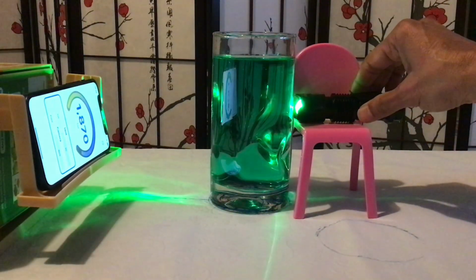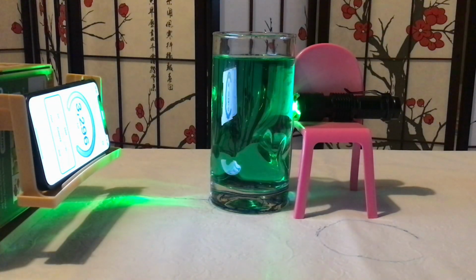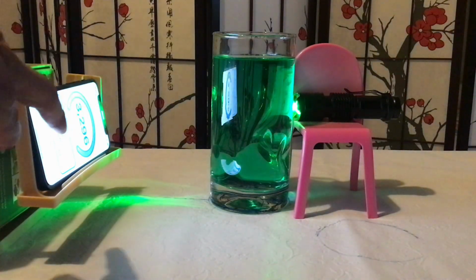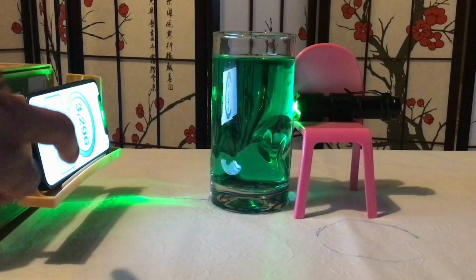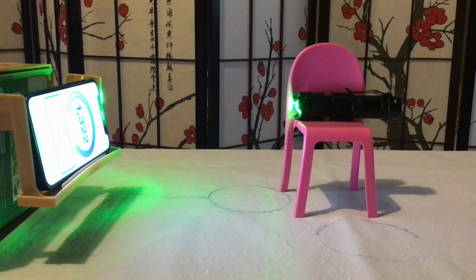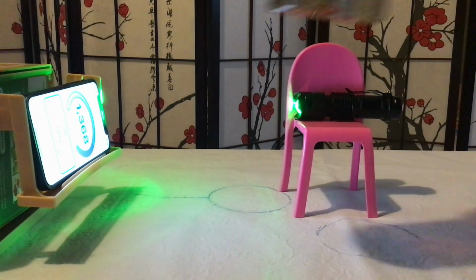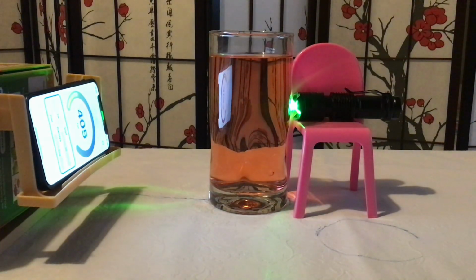When I pass green light through the green color water, the transmitted light measures about 3296 lux. This means most of the light is transmitted, very little is absorbed, since the color of the light matches the color of the solution. Now when I replace the green water with red color water, the transmitted light drops to around 425 lux.